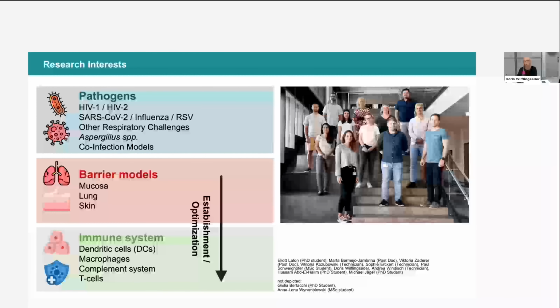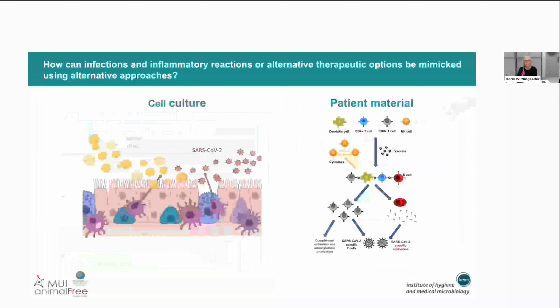These models in our lab, we established and optimized. And now we are offering a standardized platform of host-pathogen interaction. This we combine also with data from patient materials, because we have a very close collaboration with the internal medicine at the Tirol Kliniken here in Innsbruck.